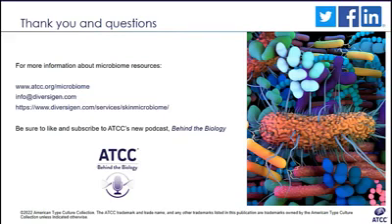Okay. Now, can you talk about some of the challenges in getting reproducible and or comprehensive antimicrobial resistance signals from skin microbiome analyses? That's a very interesting question and topic, I'm sure, for another webinar, but I would say that there are two main challenges that I can think of, which are sequencing depth and the host content. Since antimicrobial resistance genes usually make up such a small percentage of the sequences in your metagenomic sample, it's going to be challenging trying to find that sweet spot of getting enough coverage to identify all these resistance genes and the different classes in your sample.